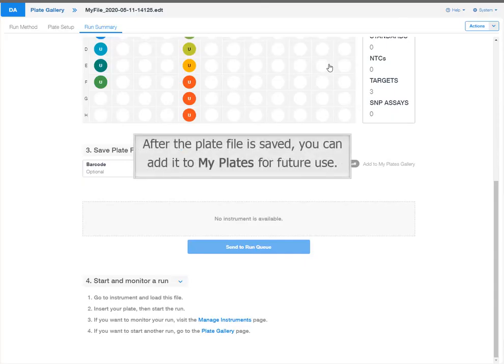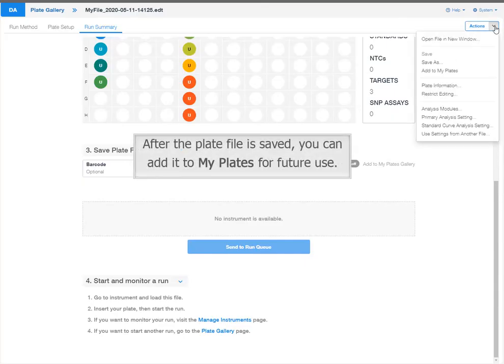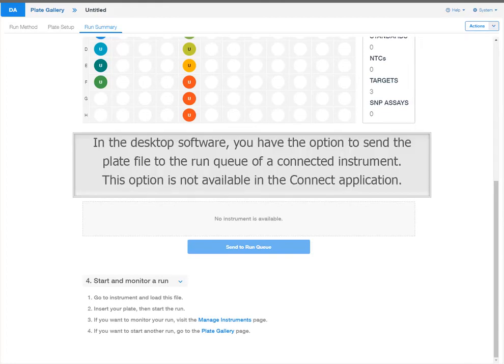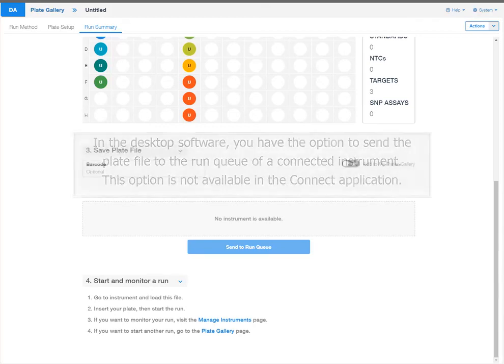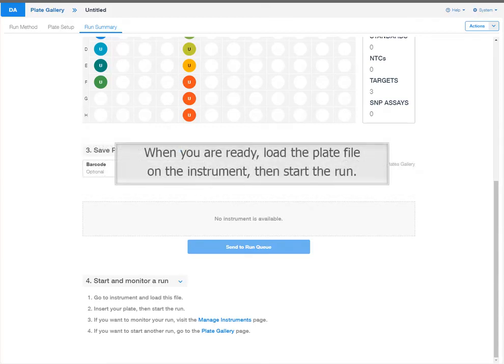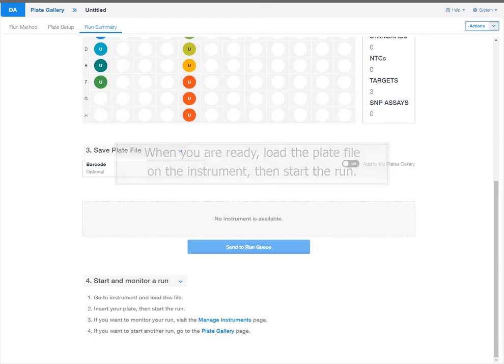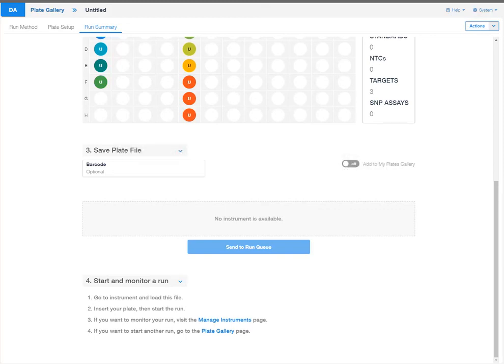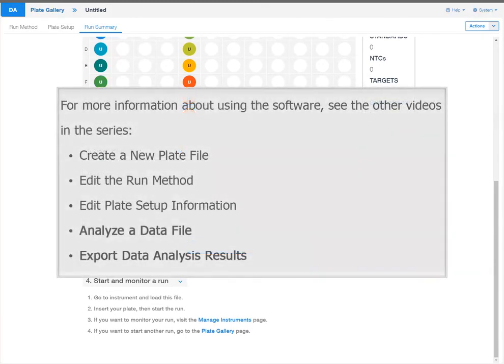After the plate file is saved, you can add it to My Plates for future use. In the desktop software, you have the option to send the plate file to the run queue of a connected instrument. This option is not available in the Connect application. When you are ready, load the plate file on the instrument then start the run. This concludes the Edit the Plate Setup tutorial. For more information about using this software, including analyzing a data file and exporting results, see the other videos in the series.